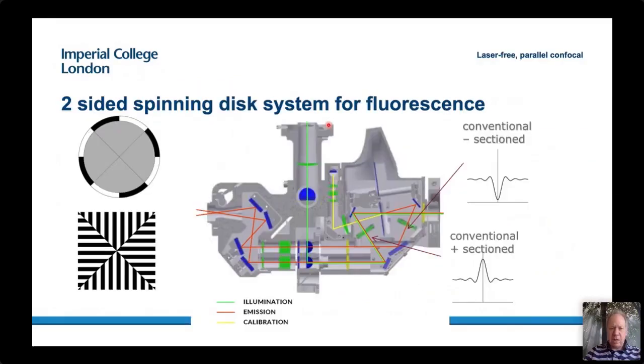So our idea was to say, can we do better than that? This again was just over 20 years ago. Can we do it more efficiently by essentially squashing those pinholes right up next to each other? And the end result, after a few more years of research, is what you see in the Aurox systems now. Essentially, they're a grid pattern on a disc, which we then rotate. When we're in focus, we project this grid pattern onto our object. We see high contrast in the grid pattern coming back. We then project it back through the disc and onto a camera.